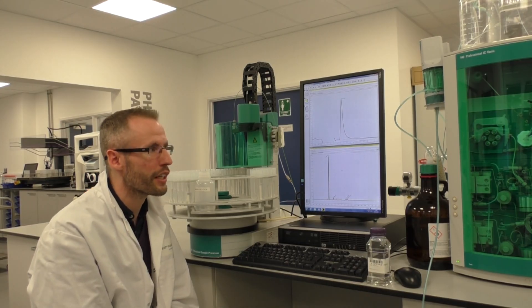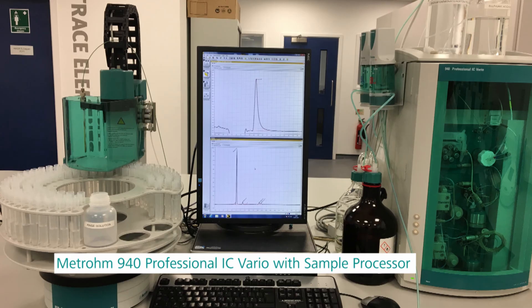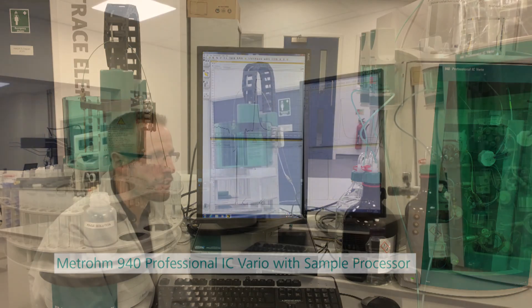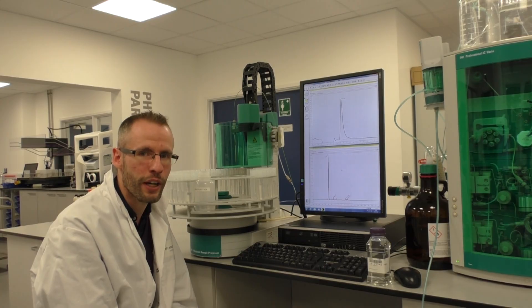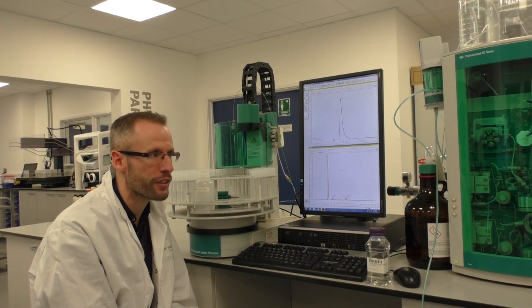Things that we like about this system is with the single auto sampler it allows us to run both the methods simultaneously. So we just have to set up both the methods per day and then just run it and it will be all done in the same day.